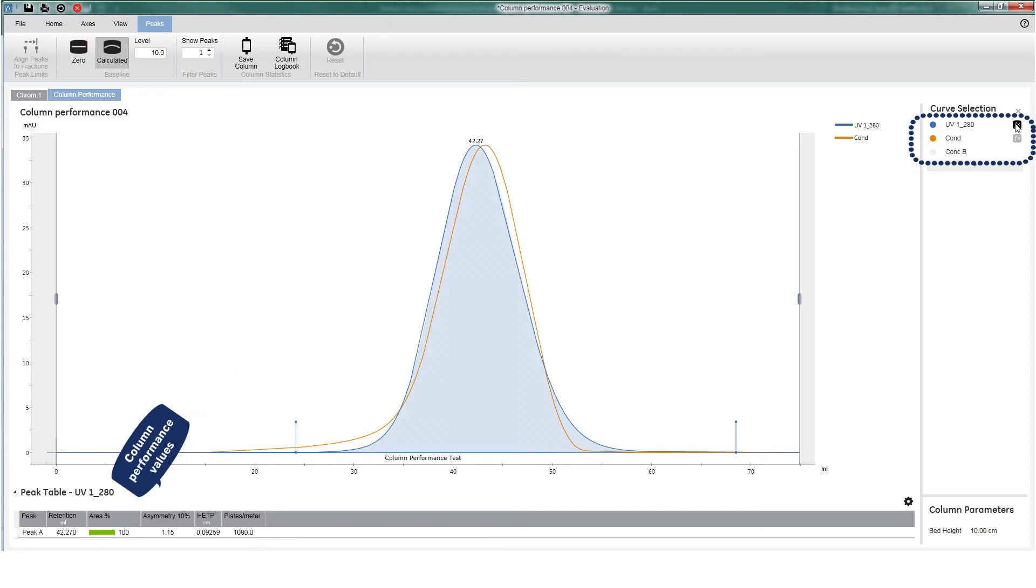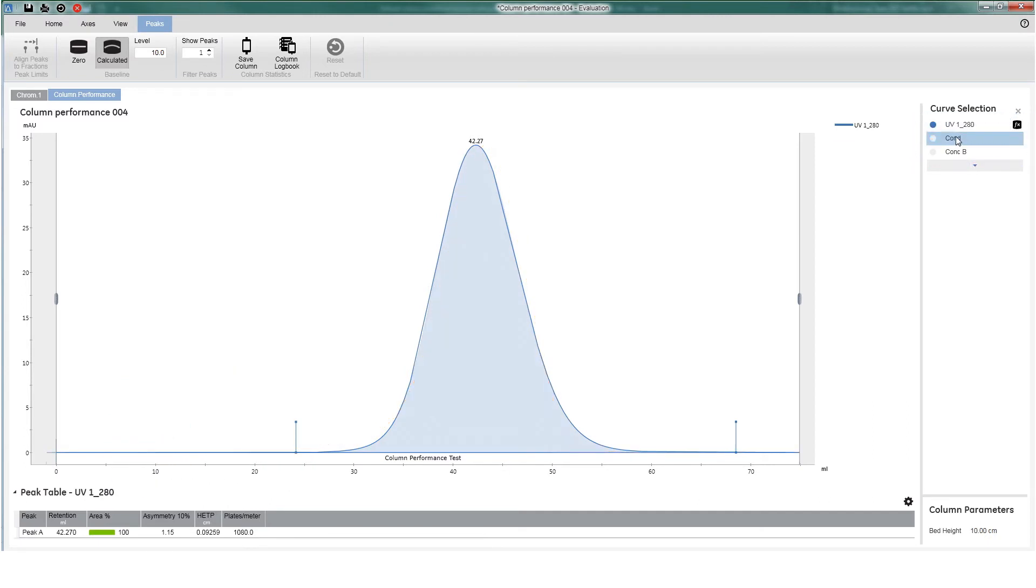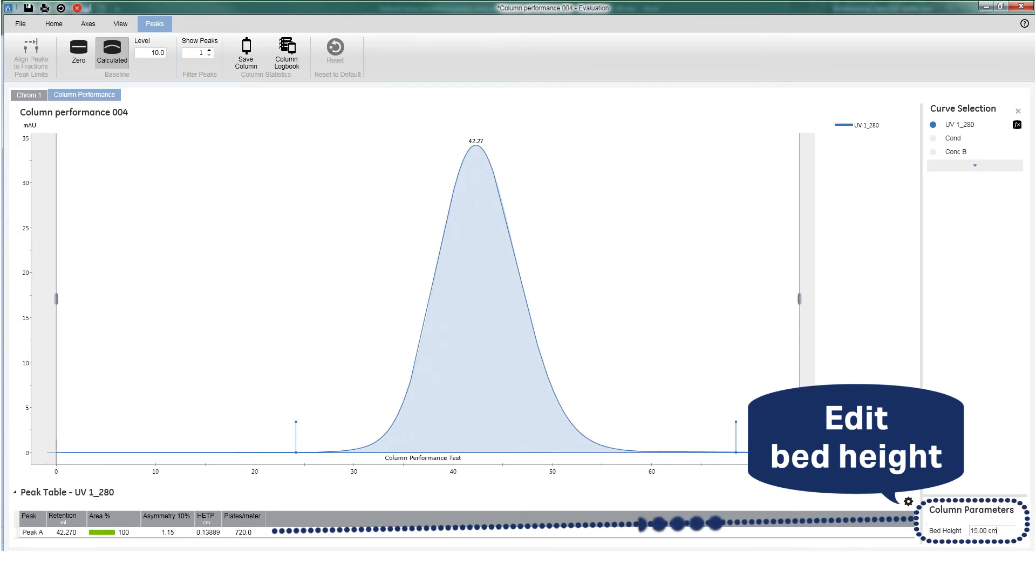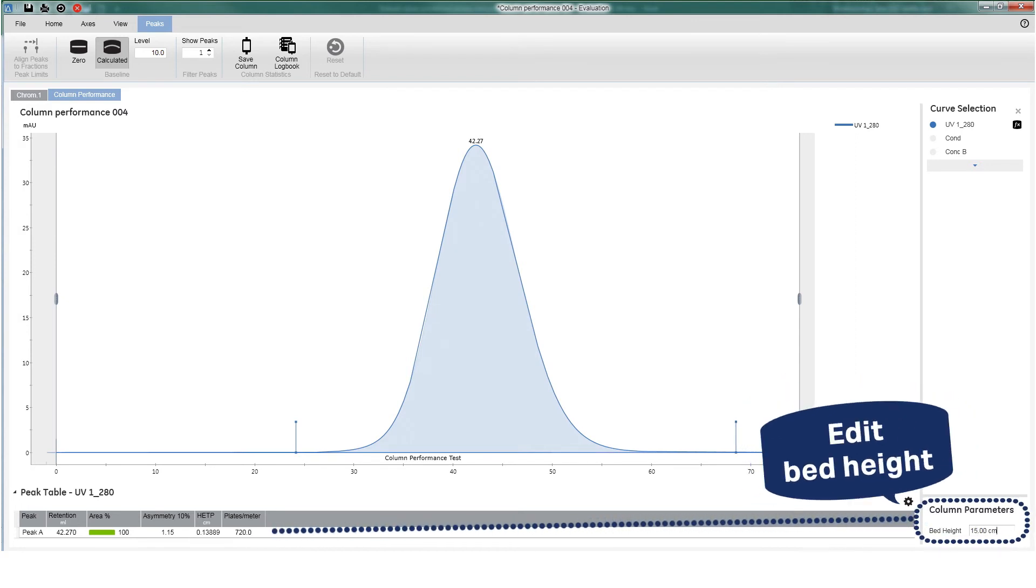The column performance values in the peak table are updated with values based on the chosen column performance peak. The bed height of the column can easily be edited, and the column performance values are updated.